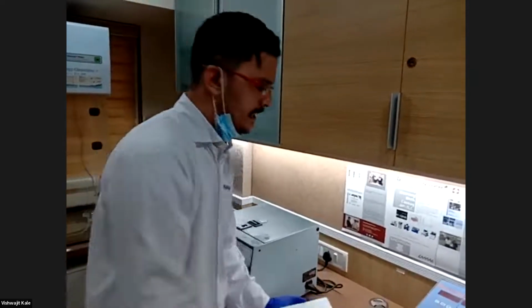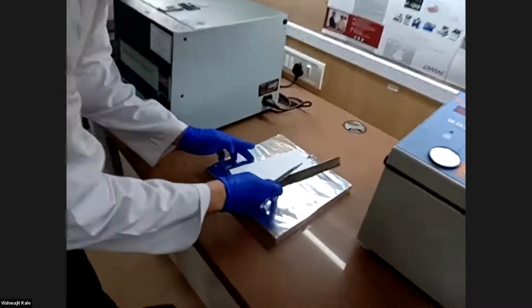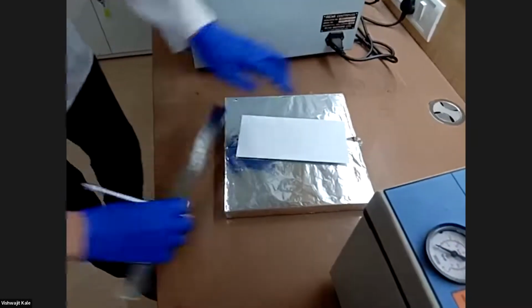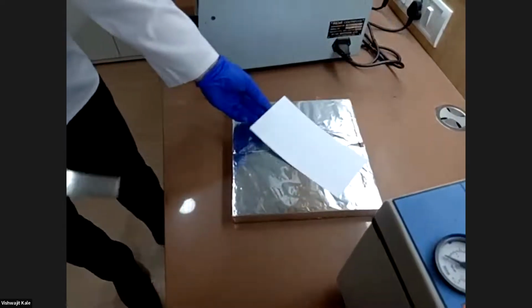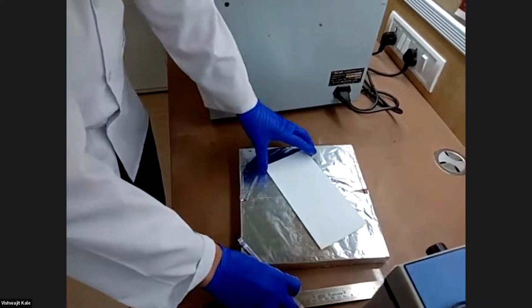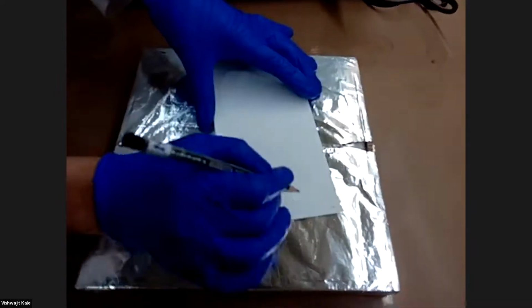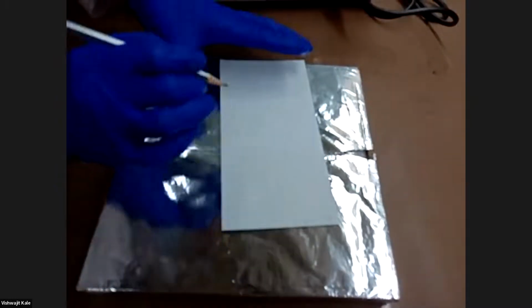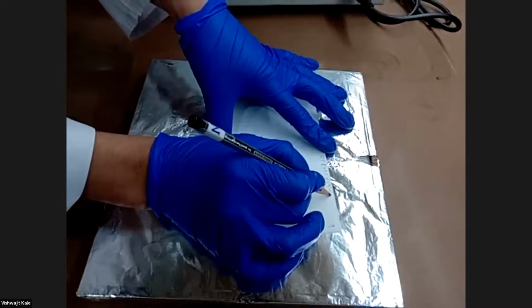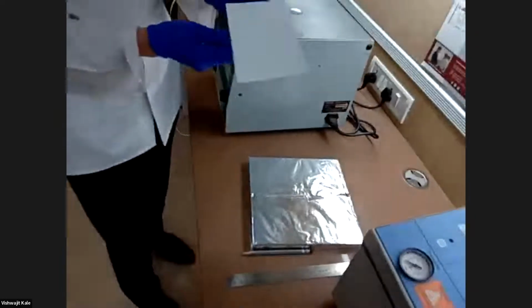After cutting the plate properly, you need to label the plate, because labeling is very important in analytical chemistry and in any analysis. If you do labeling properly, it is very easy to mine data after completion of analysis. We are marking the solvent front, because in today's analysis, I will show you the manual development. We have development modules available which will automatically develop the plate up to the desired distance and take out the plate after development automatically. In that case, we are not required to mark the solvent front position, but here I'm manually putting the solvent front position, and I'm giving the name DPPH assay, which we will do on today's plate. I'm also using the date in labeling of the plate, because dates are very unique. You can trace back the analysis file and plate anytime.